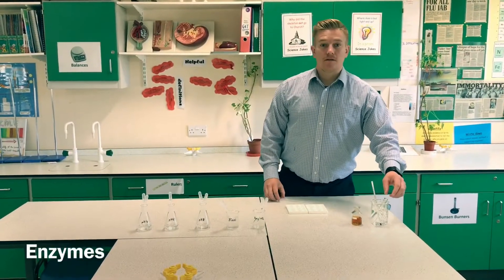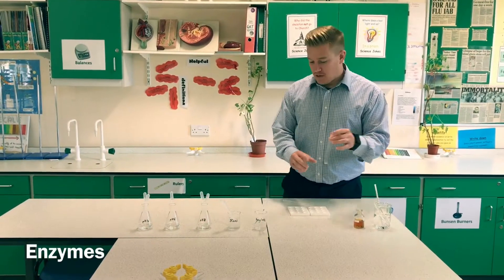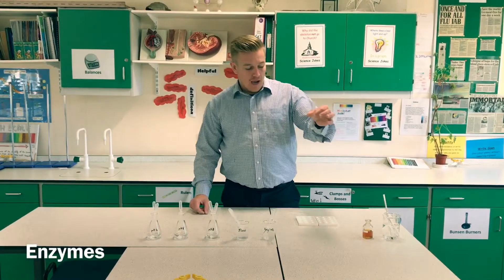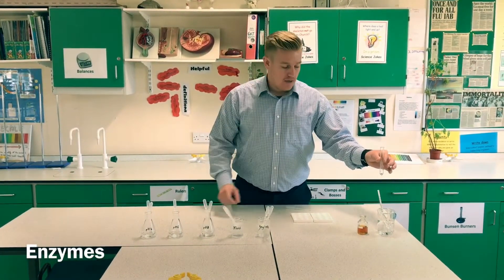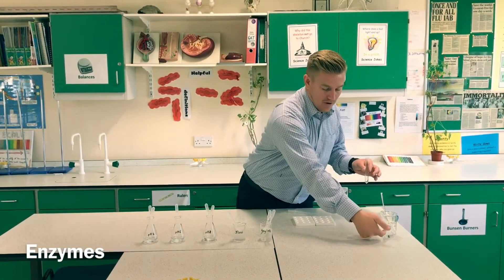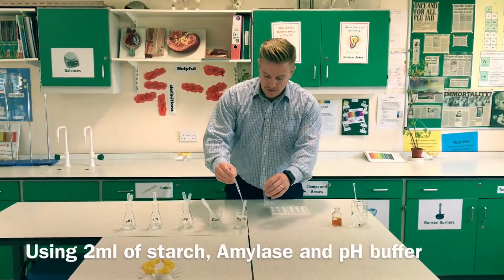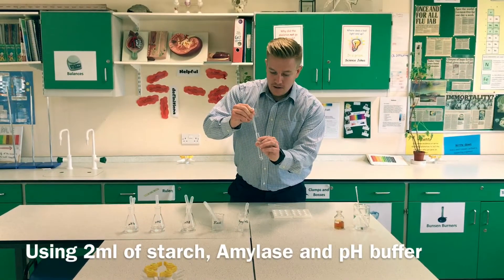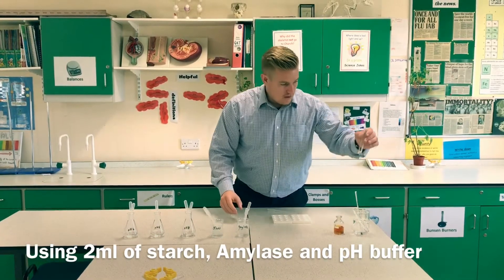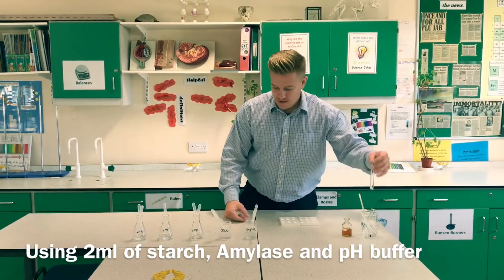Welcome to the enzyme required practical. I'm going to prepare my sample and get the temperature to a stable 30 degrees in my water bath. I've already prepared using hot water — each of my samples will have a 2ml solution. There's my amylase going into the water bath.